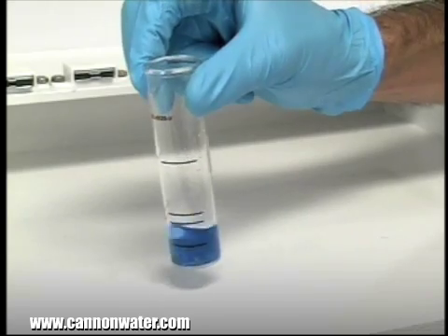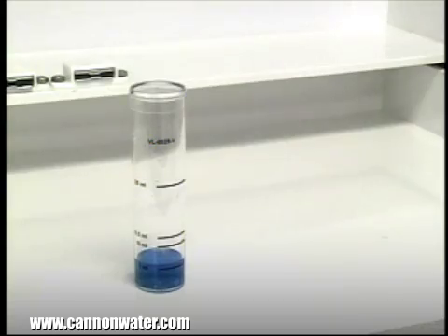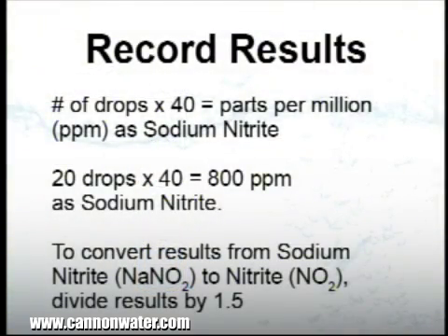According to the endpoint ID procedure, the titration is complete when the sample has changed from orange to blue. In this example, each drop was equivalent to 40 parts per million as sodium nitrite. The sample took 20 drops to reach the endpoint, therefore this sample contains 800 parts per million as sodium nitrite.